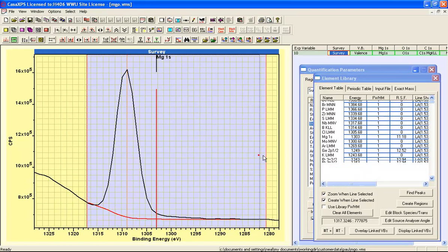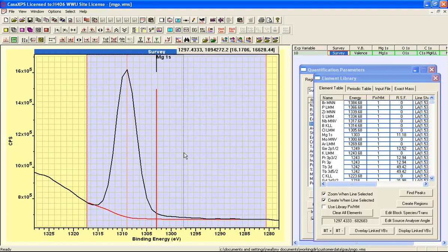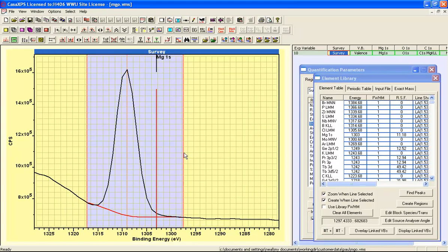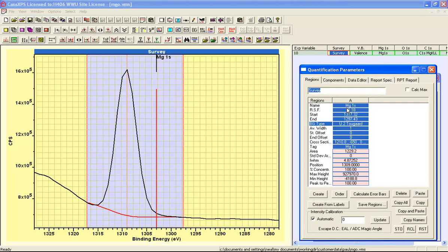And I can adjust this region so that it calculates the area above the background, and because I created the region using the element library, the relative sensitivity factor has been brought in for the survey spectrum and this particular magnesium 1s interval.